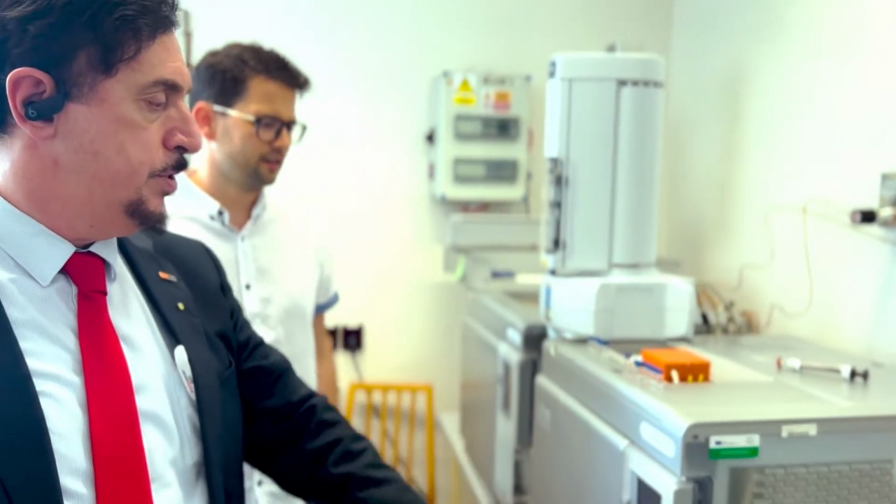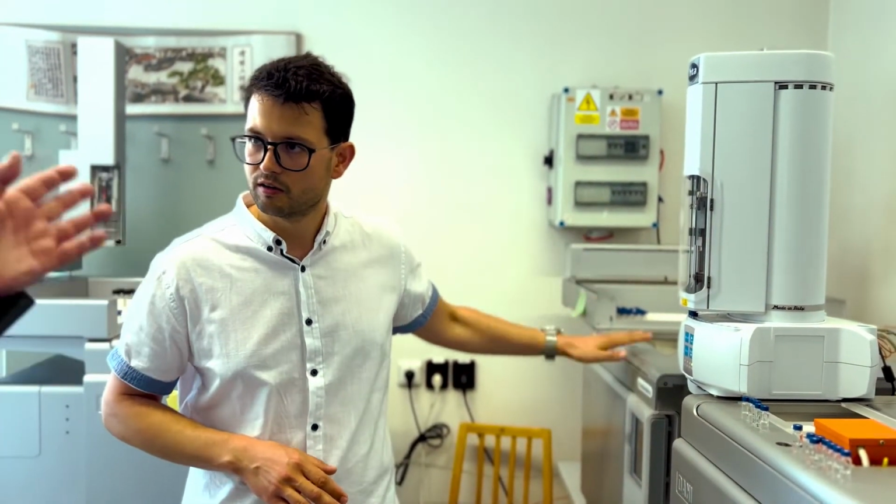Well, in our team we are doing a lot of different things. One big group of our research is protein-oriented, which we are currently talking about. And the second large group is lipid or oleochemistry oriented. Most of the time we use these machines for the oleochemistry research. For example, we developed a technology for turning waste fats into biodiesel. So this is important. You are changing fats to biodiesel. Yes.